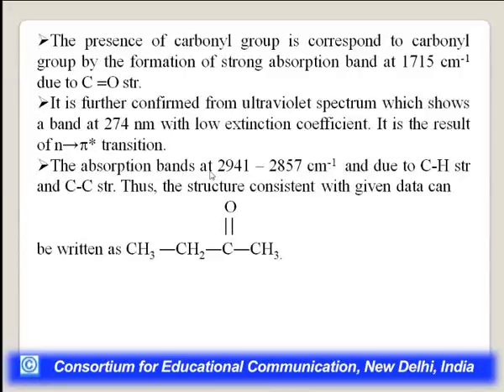The absorption bands at these values are related to these groups: this value is related to carbon-hydrogen stretching, as we have told you, and the 1460 value is related to carbon-carbon stretching. So by calculating all these data, the structure comes out to this.